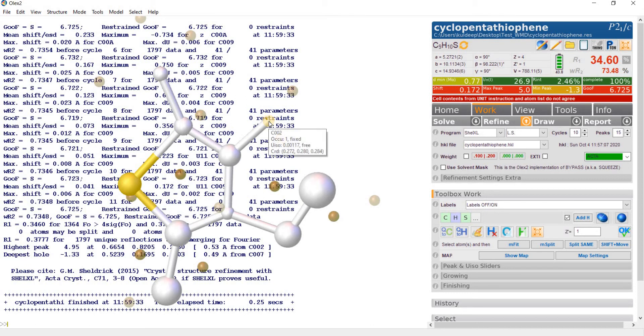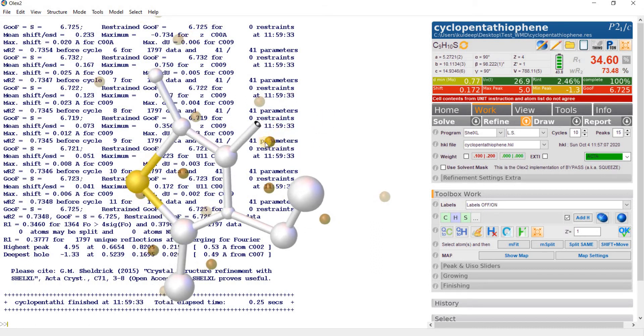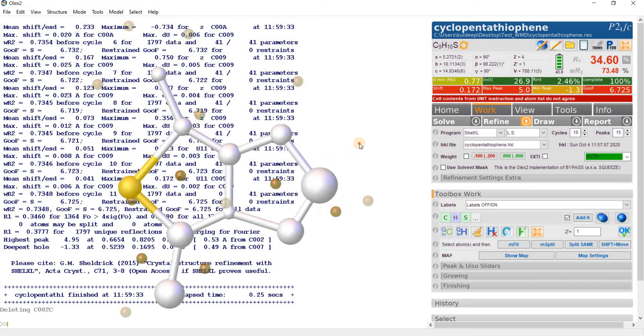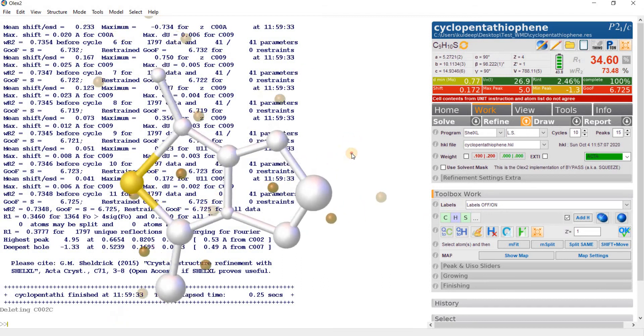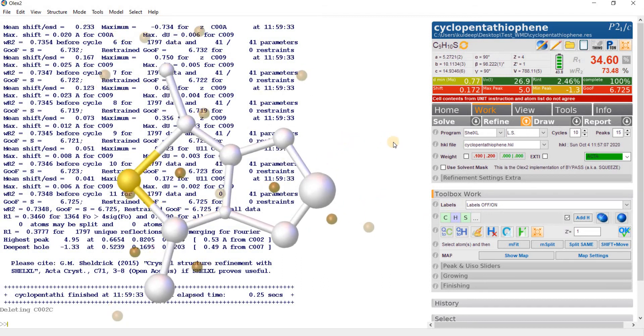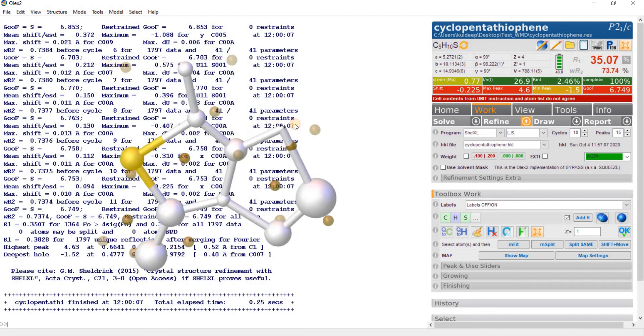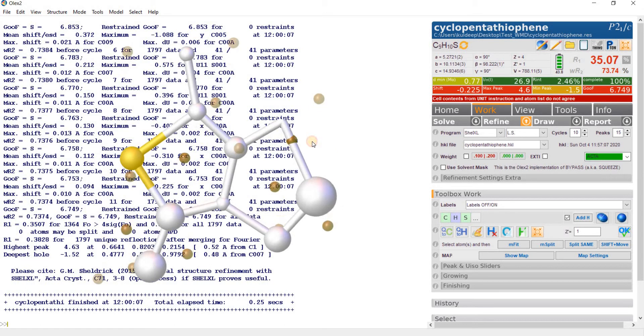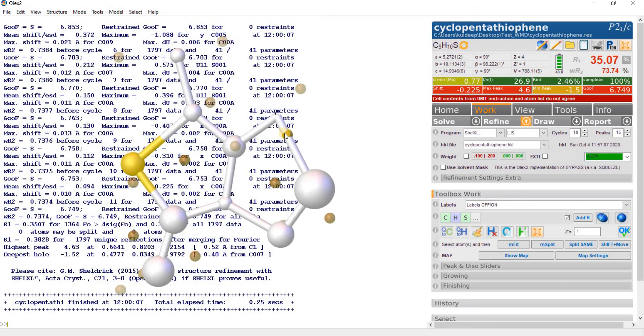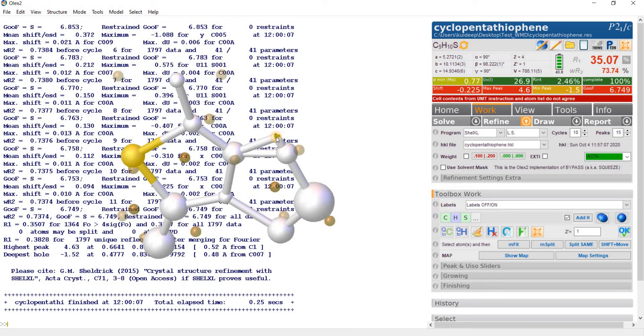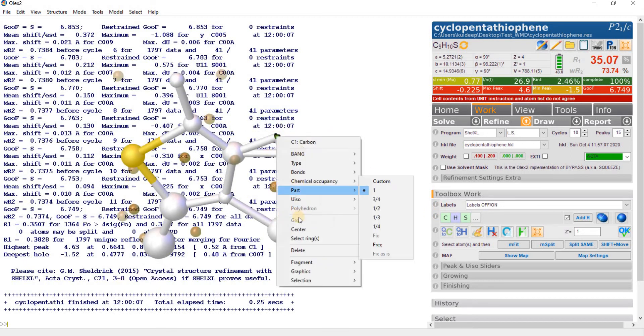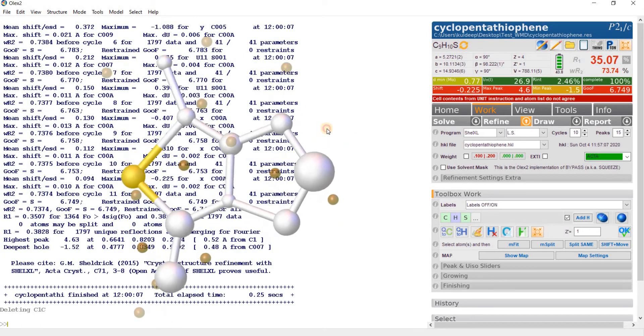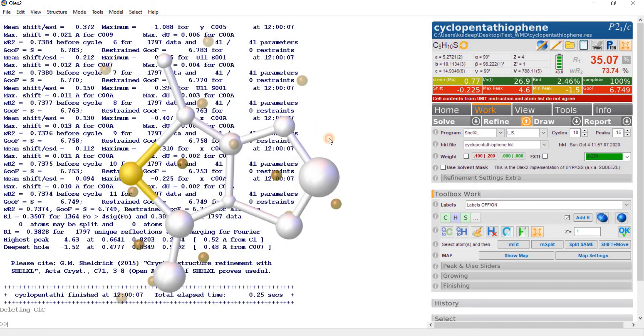Go to refine, press this arrow. There are different programs. Select SHELXL with 10 cycles. Since it is a small molecule, 15 or 20 cycles are enough. Select CIF to generate the CIF file in the directory. Now press refine. The bond is now not adjusting, and the thermal of this carbon is very small, 0.00117.